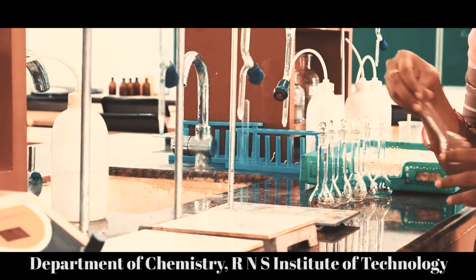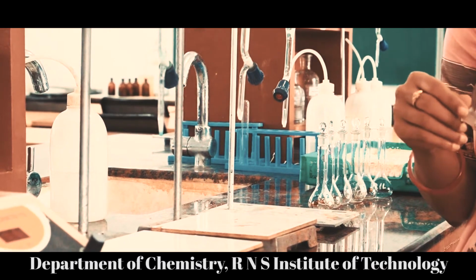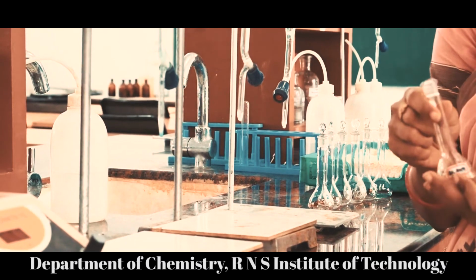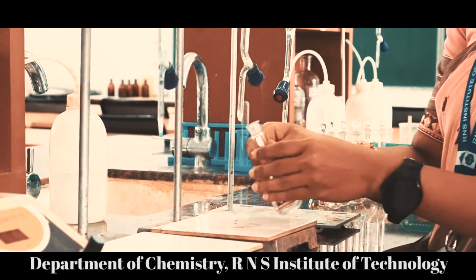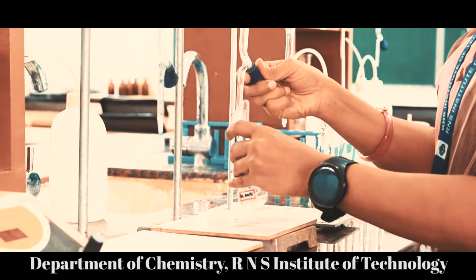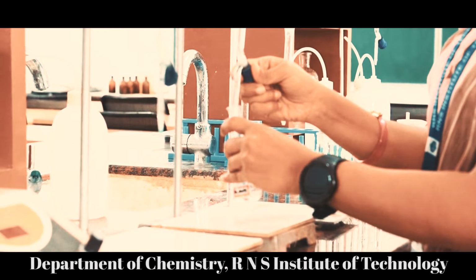Now we are starting with our experiment. We are adding standard solutions to all the volumetric flasks. For the blank solution, we are not adding any copper sulfate solution. We are adding 2.5 ml ammonium hydroxide and diluting it to 25 ml with distilled water.